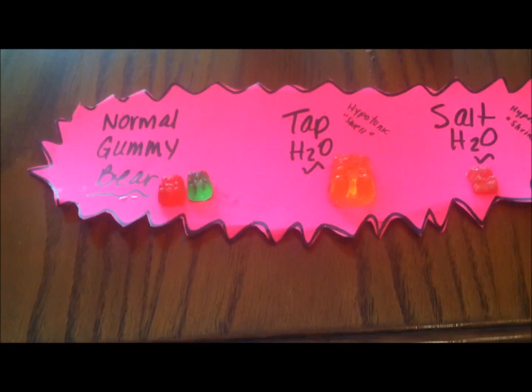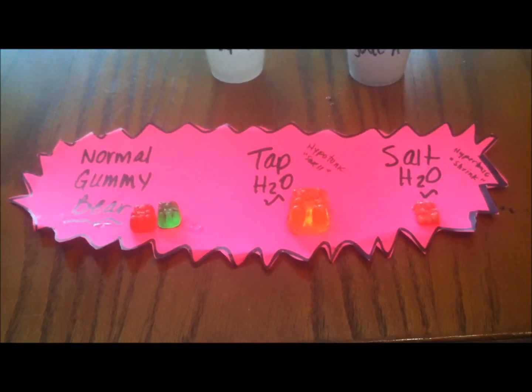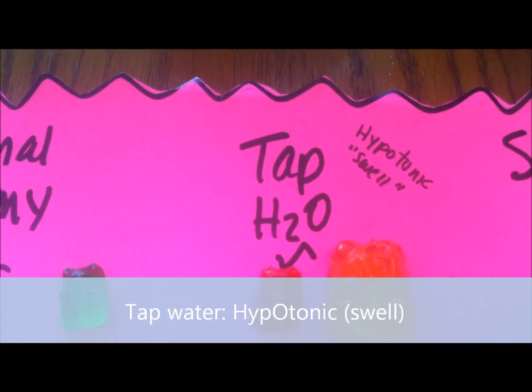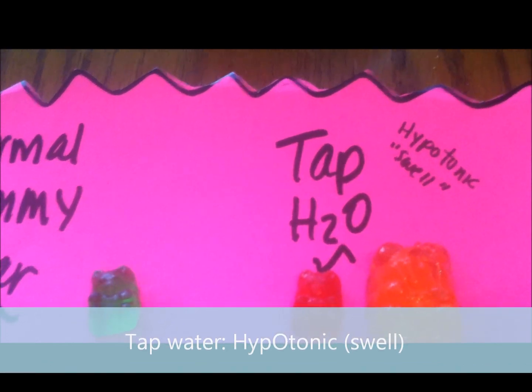Good morning. This is day 2 of the Gummy Bear Osmosis Lab. As you can see, the gummy bears are done soaking in tap water and salt water overnight. Here is the normal size of a gummy bear compared to the gummy bear that was soaked in tap water, which is hypotonic and caused the gummy bear to swell, almost tripled in size.